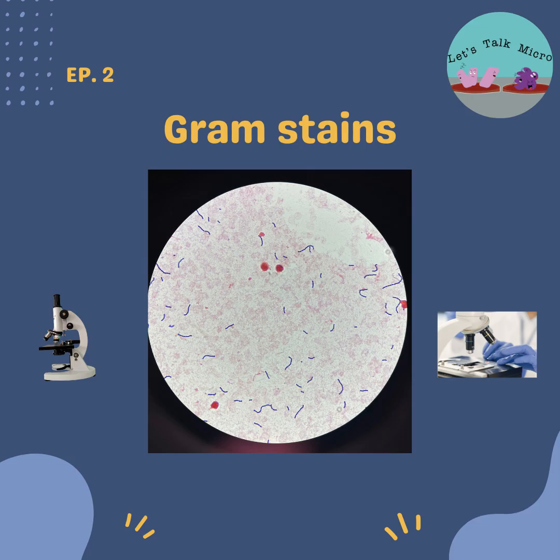Keeping in mind there are some exceptions, of course. You don't reject outpatients because it's hard to recollect a sample, and you shouldn't reject babies, of course. You will still plate it, especially neonates. So it provides a clue as to whether your sputum was actually a good expectorate versus a sample that's full of saliva, which will contain a lot of epithelial cells. So it's a wonderful tool that you have as part of your workups in the lab.